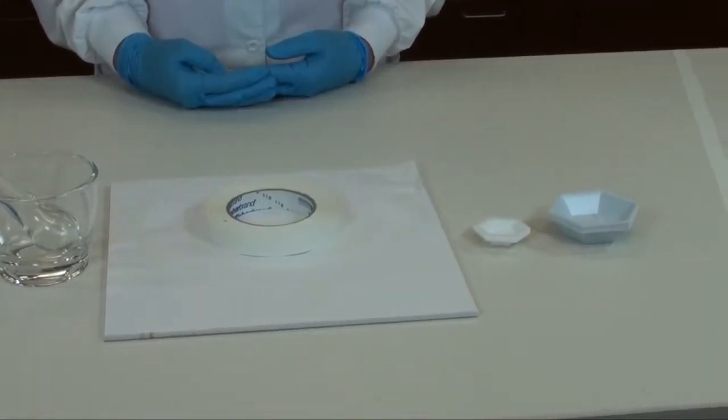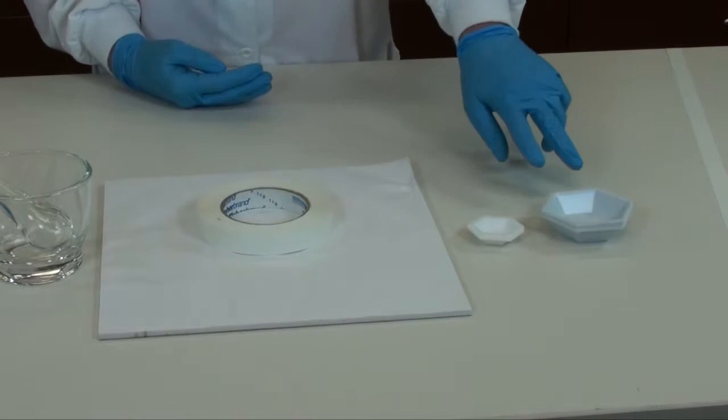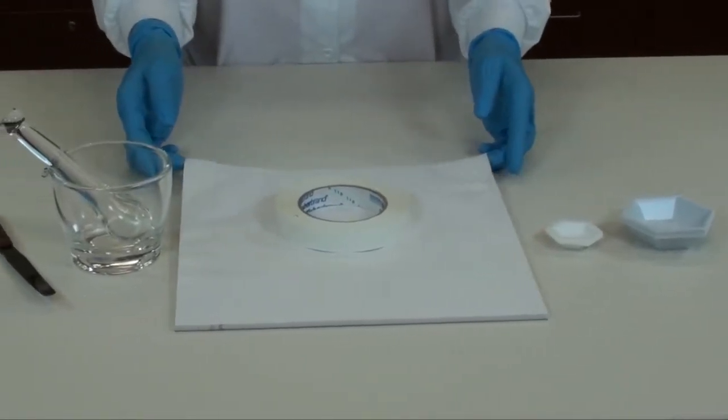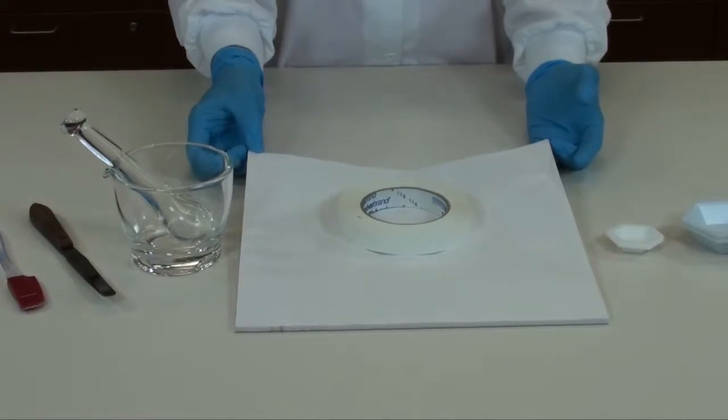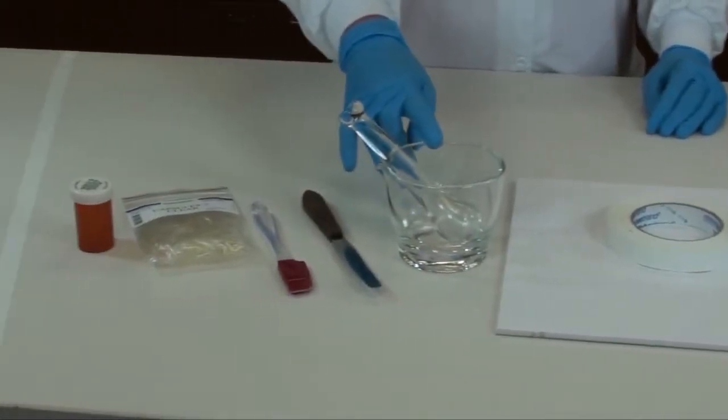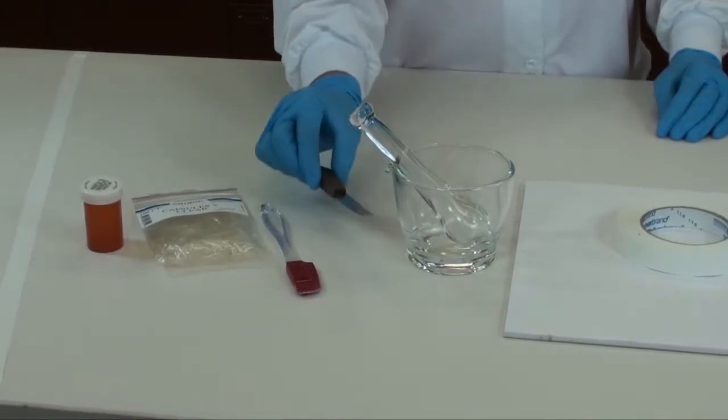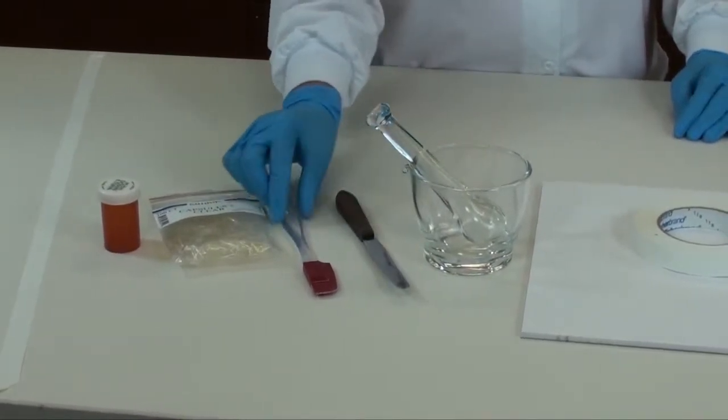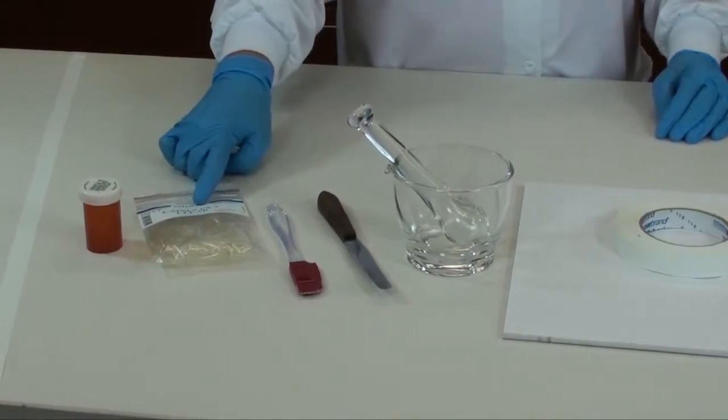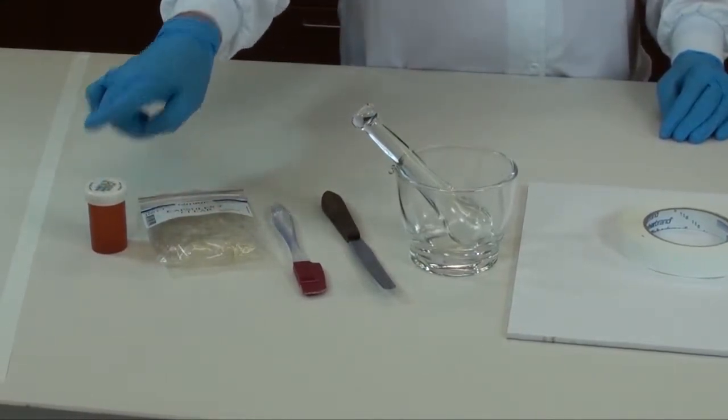The required equipment for the capsules prescription are medium or small weigh boats, ointment paper with tape so you can tape it down, a glass mortar and pestle, a metal spatula, a rubber spatula, empty gelatin capsules, and a prescription bottle to dispense the prescription.